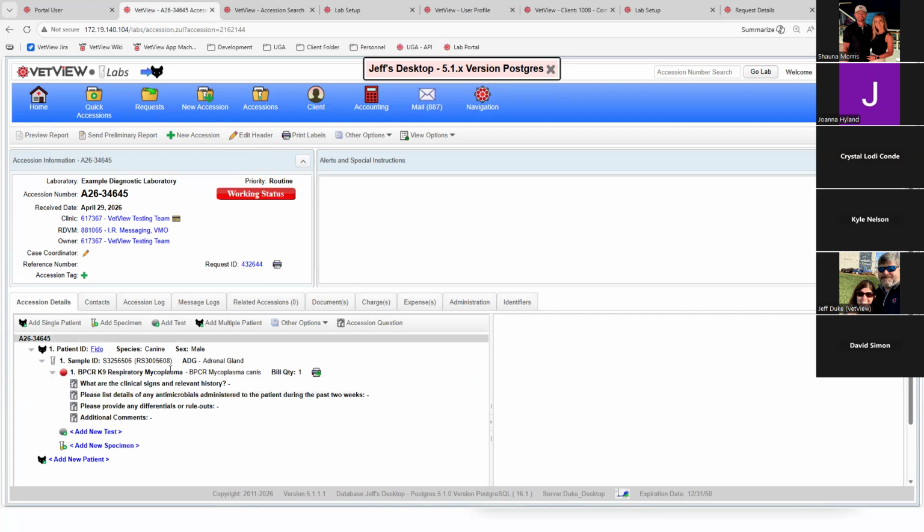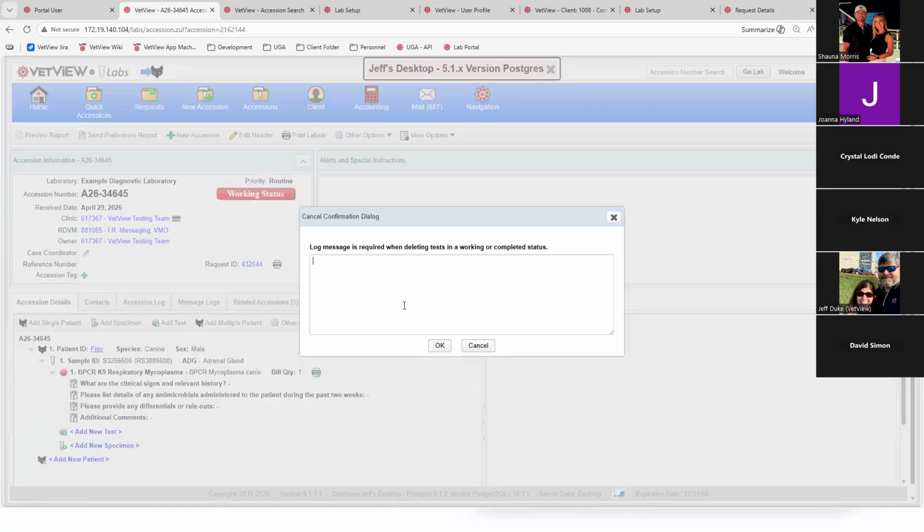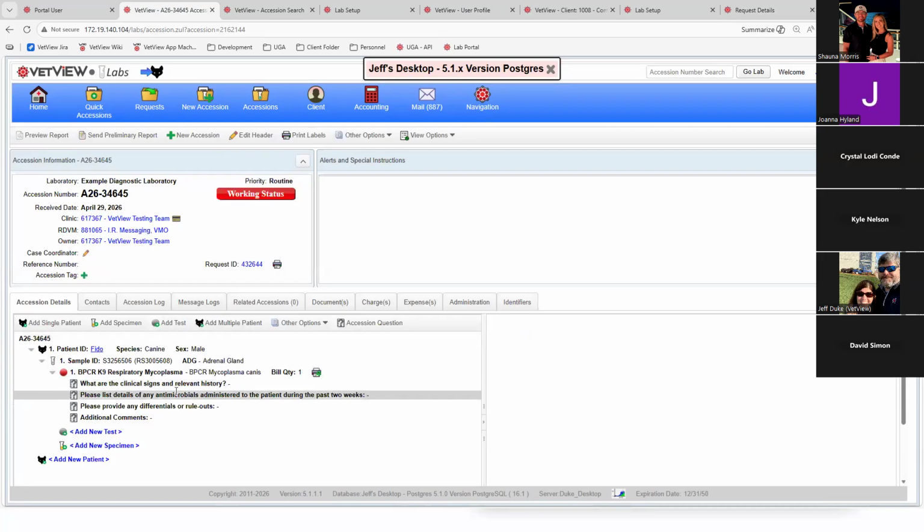You can then make adjustments. So if they submit one thing and you call them up and say that's not the right test code, we recommend you do something else. Again, you can add tests, remove tests, or cancel tests with a reason in there as well, updating that request once it's been accepted in the system there. And there are also other mappings and things as well.